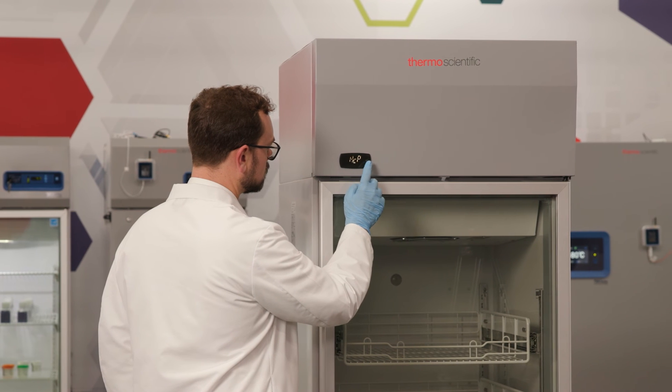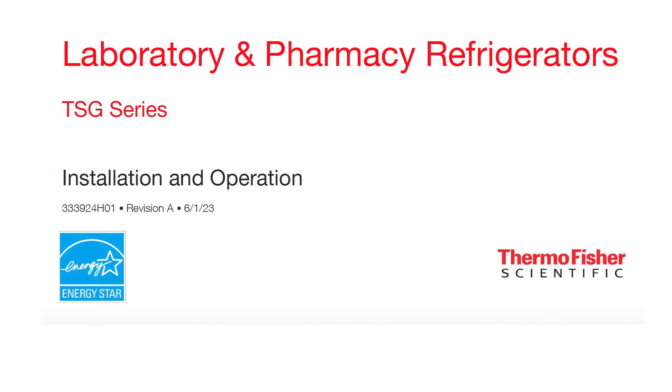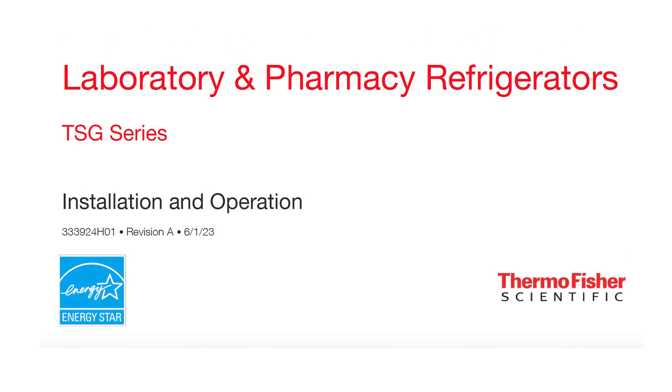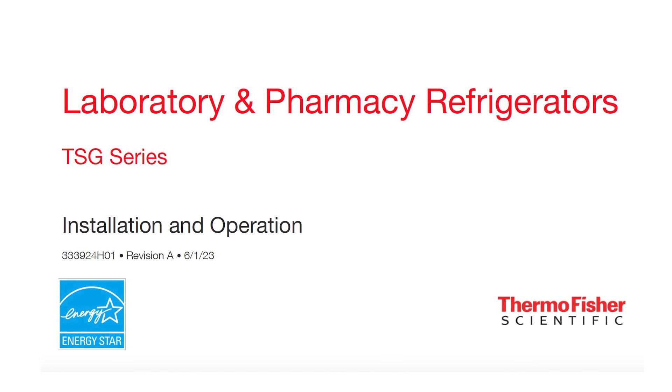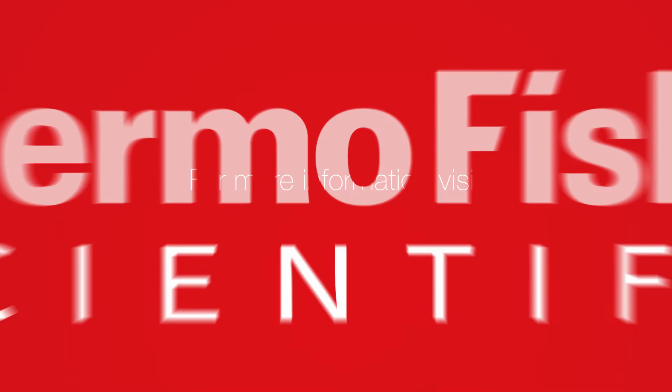Temperature setpoint is just one of the parameters that can be modified on TSG series refrigerators. Refer to the ThermoScientific TSG Installation and Operation Manual for additional information. Visit thermofisher.com/labrefrigerators for more information.